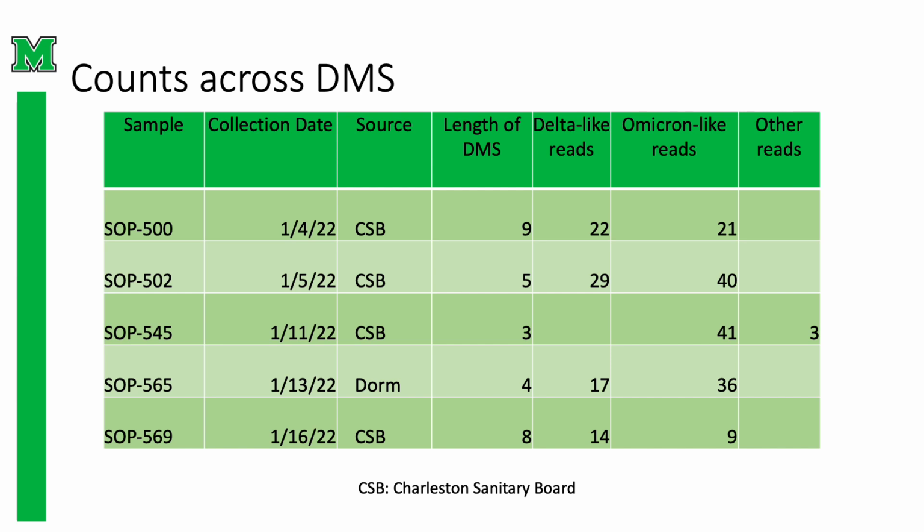We were able to count the number of reads mapping to each of the discriminating mutation sets generated for 5 samples collected in the first half of January. These indicate variation in the Delta-Omicron proportions. We currently do not have any validation of these proportions, but we'll discuss this momentarily. One of the samples had a discriminating mutation set which was not readily identifiable as Delta, though it consisted of only 3 loci and was thus not highly informative.